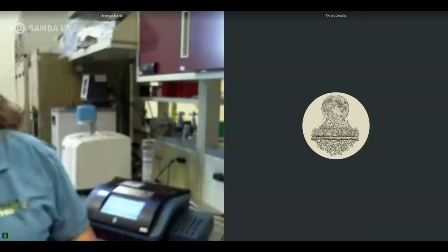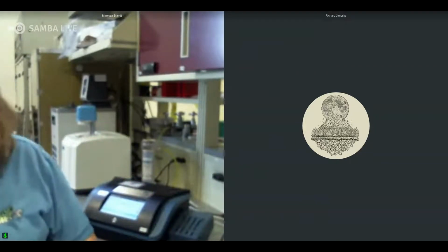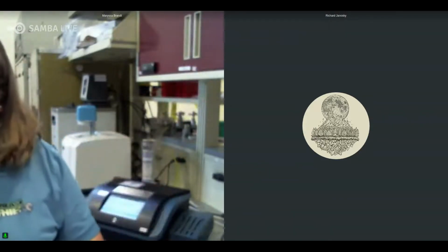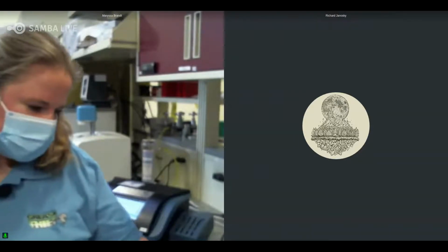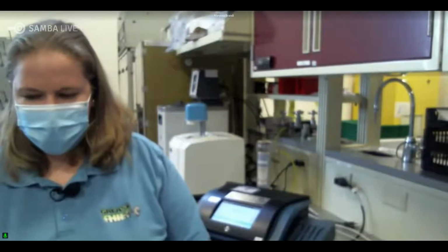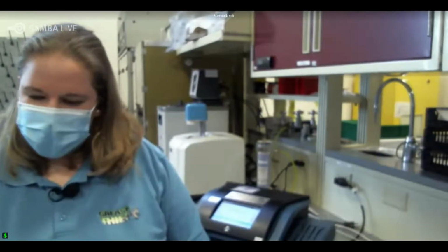So for us internally, we do clean our instrument via the manual standards of using IPA, which is isopropyl alcohol, and we do clean our instrument about quarterly. And there are instructions on how to do that if you were to get a Vapor Pro manual. But great question.